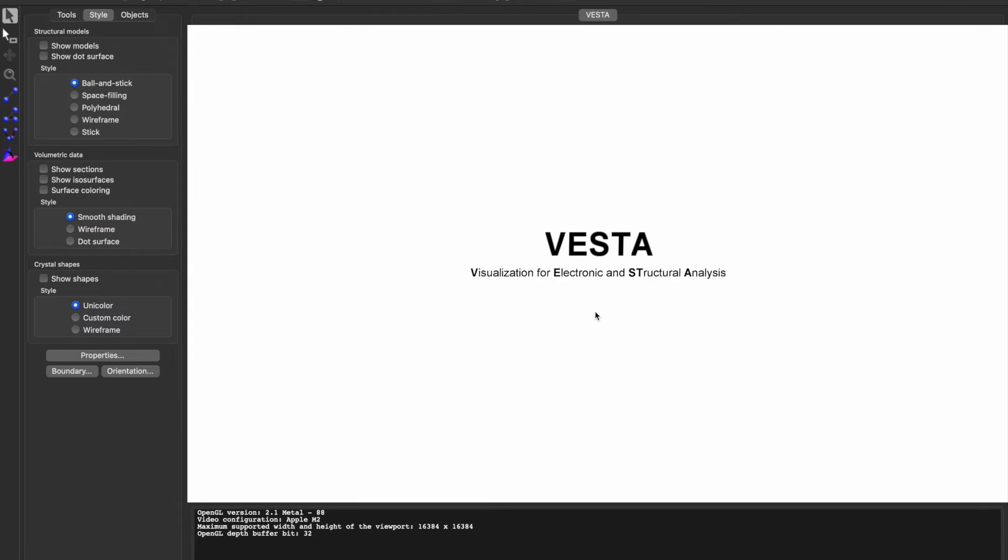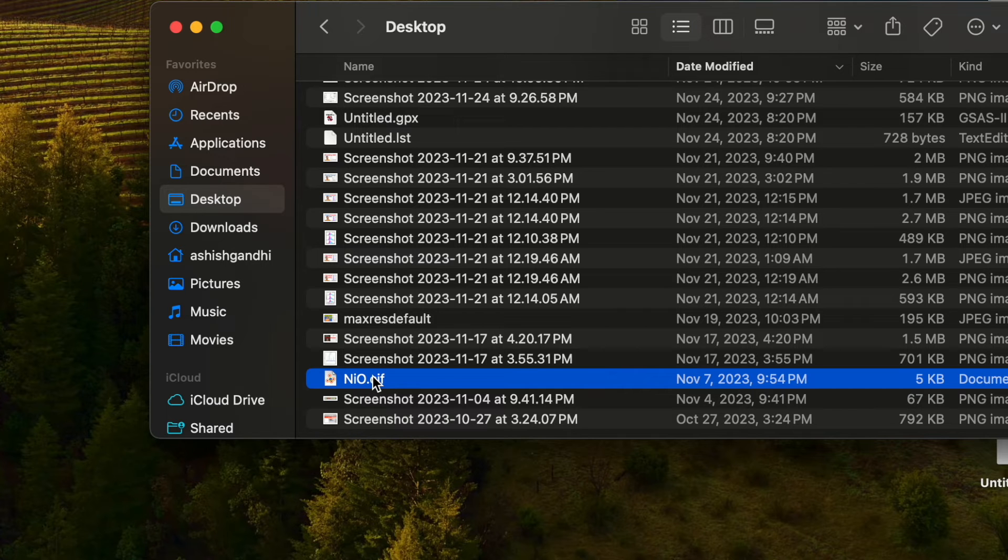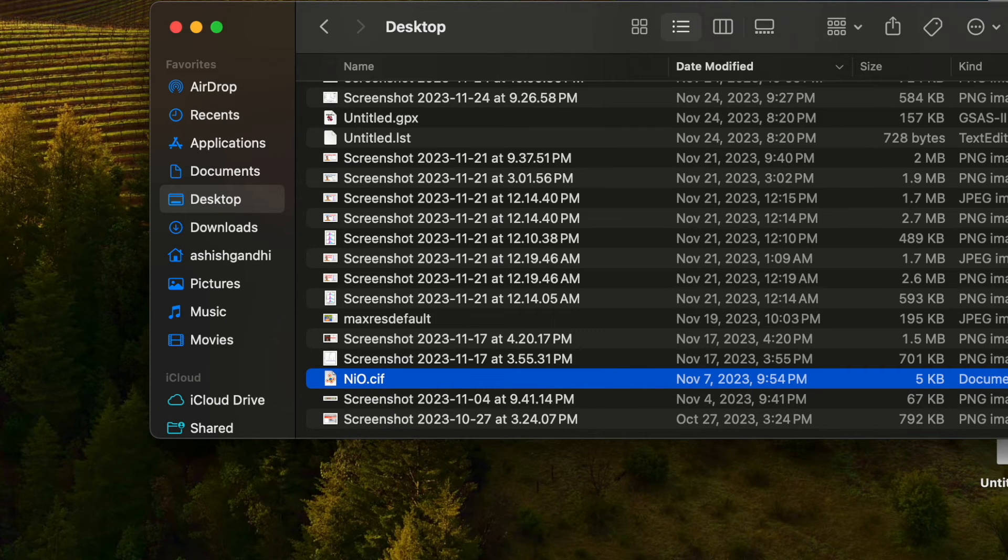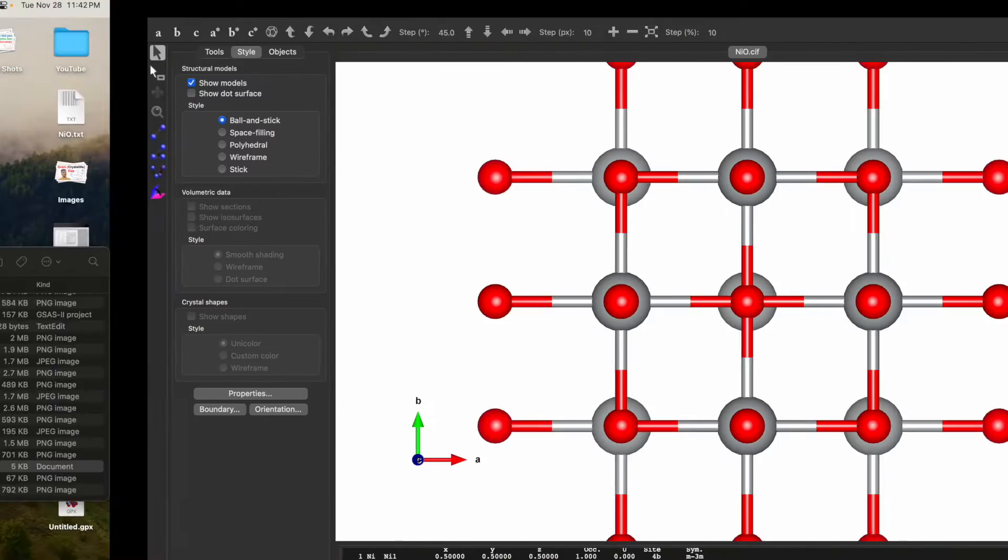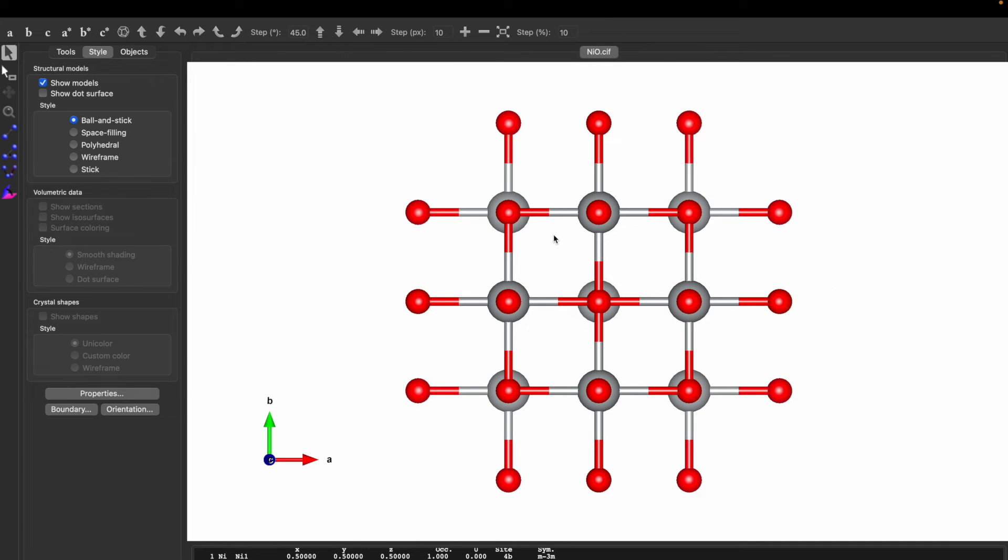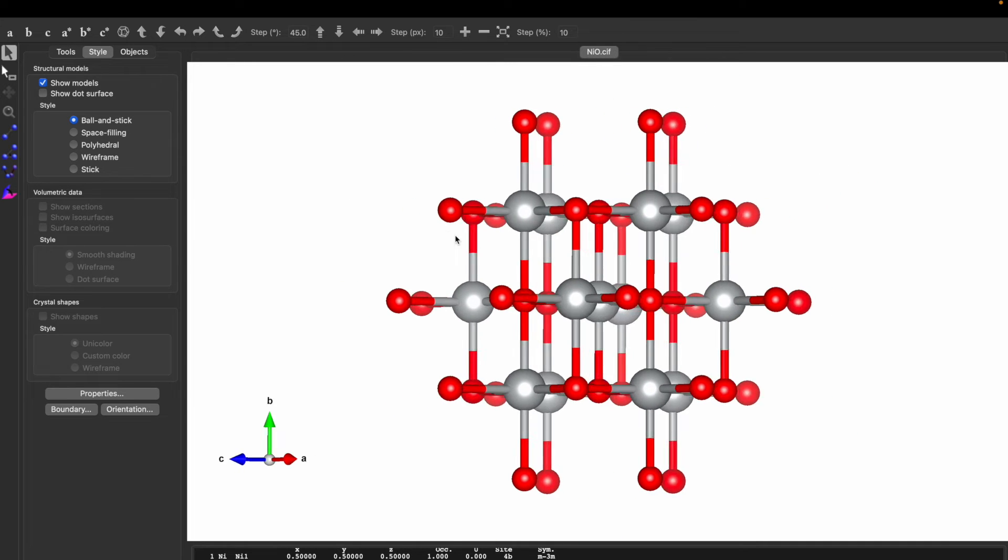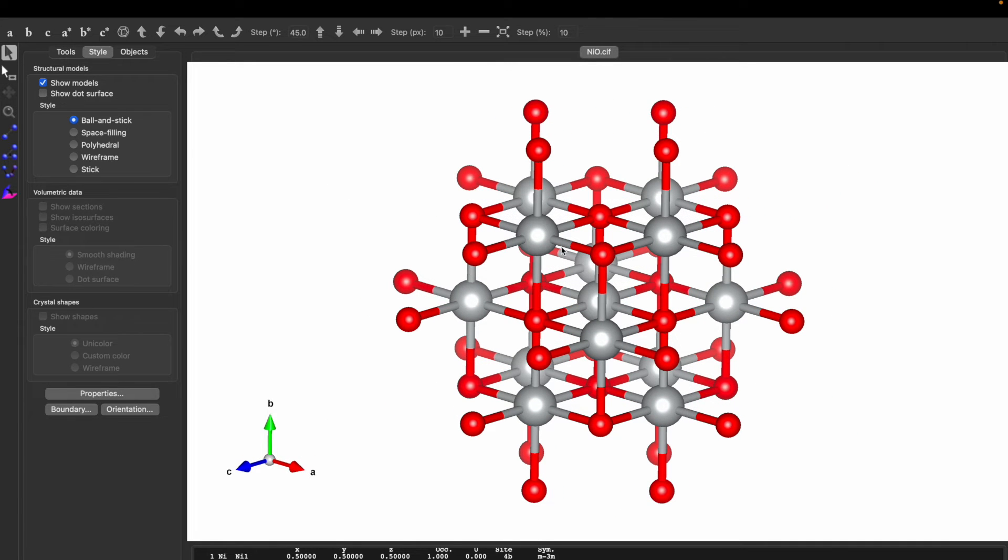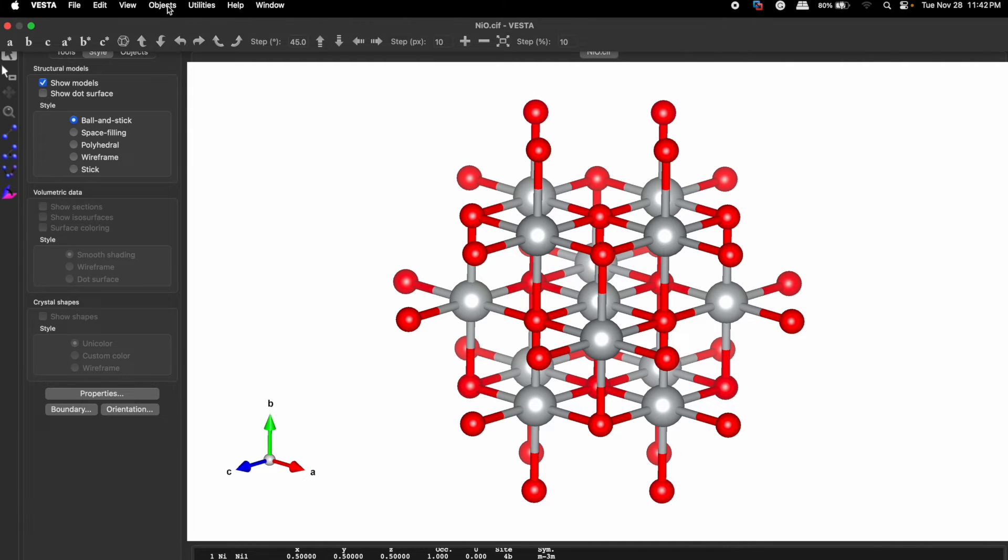So here I have a NiO CIF file. Drag it to the VESTA software and you will see a unit cell of nickel oxide. Now we want to generate XRD out of this nickel oxide unit cell. How to do that?